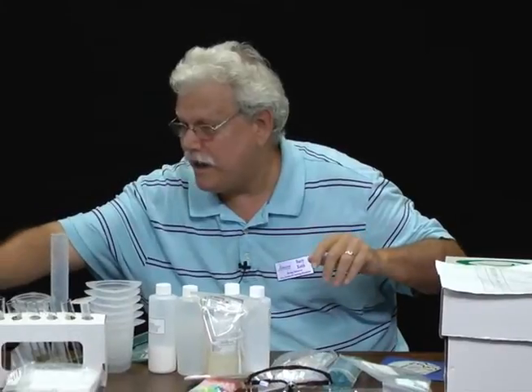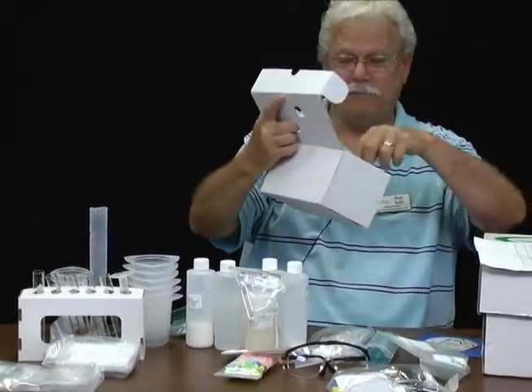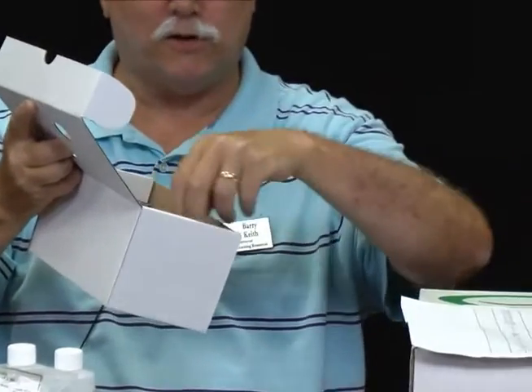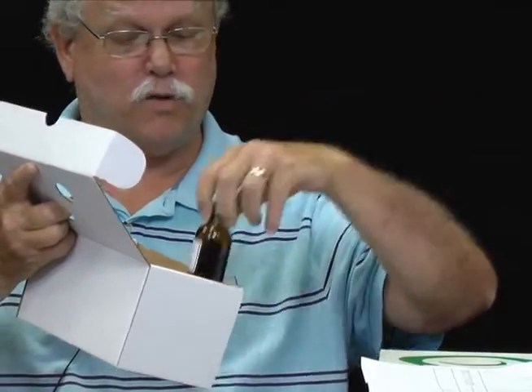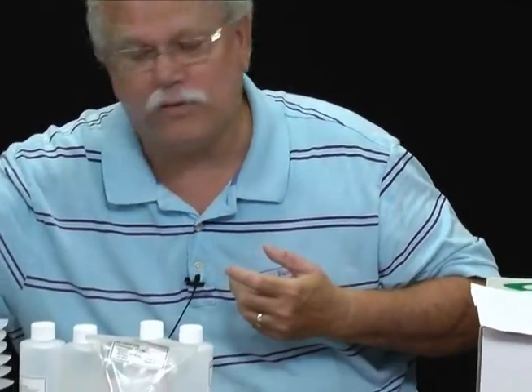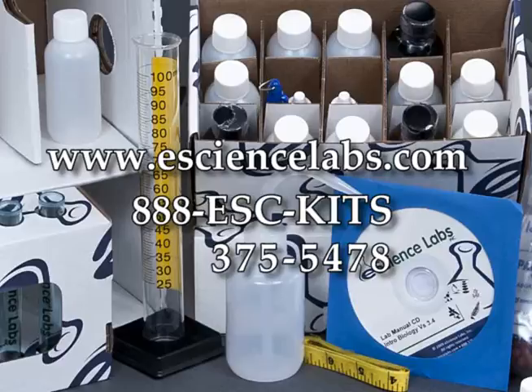Let's see. Also, we have small bottles packed in their own box. This says DNA extraction solution, so it'll be up to you to go through these bottles one at a time, check them off your list, and make sure that you have everything. Now, what if you don't have an item? If you can't find the item in your list, either email or telephone eScience, and they will send you the item for free. There's no cost for replacement items. It's important, I think, that you go through this item list thoroughly as soon as you get this lab kit. It probably won't take you 30 minutes. You might ask someone to help you do it to make it go a little bit easier.